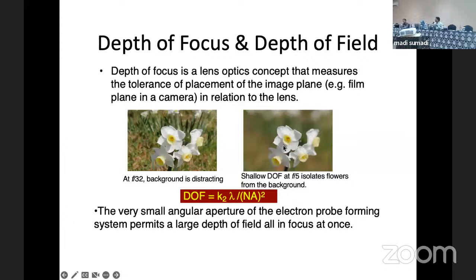And this is also a big problem when you try to see. I think with a normal microscope you are able to see it, but on a confocal microscope, it's a little bit difficult to get the focal plane. So it means you either get the background or you get the focal plane. In the right focal plane, you clearly see the structures that are emitted by the light and collected by the objective.